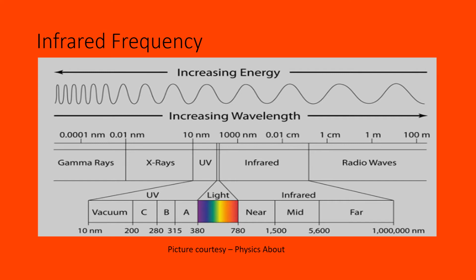See the picture. The energy of the electromagnetic radiation decreases with increase in the wavelength. Lower the wavelength, more the energy, and the energy can penetrate deep into the molecule. Higher the wavelength, lower the energy, and can only influence the peripherals of the molecule. This particular aspect has to be understood well. If you understand the story of the electromagnetic radiation in total, you will be really thrilled.